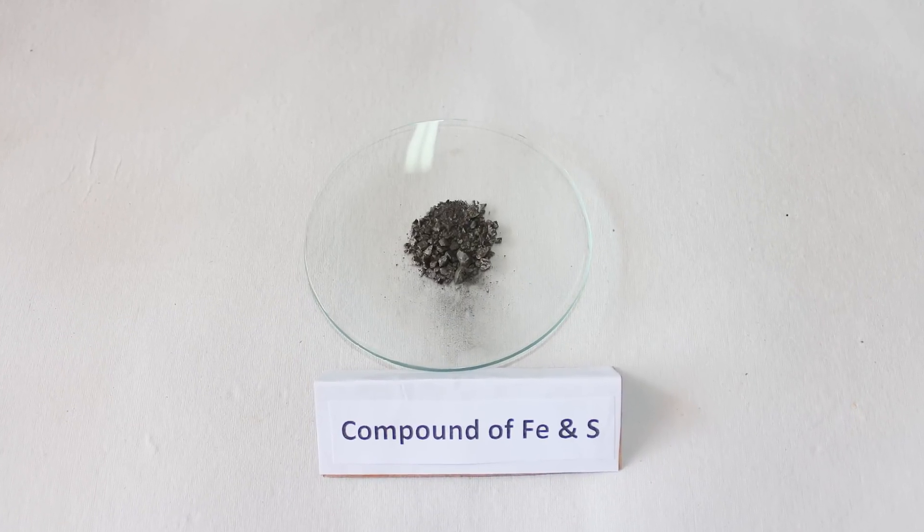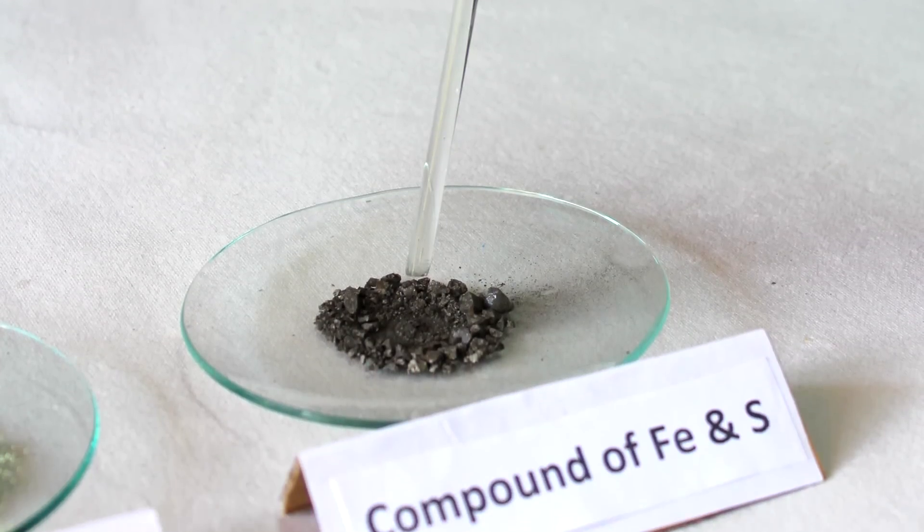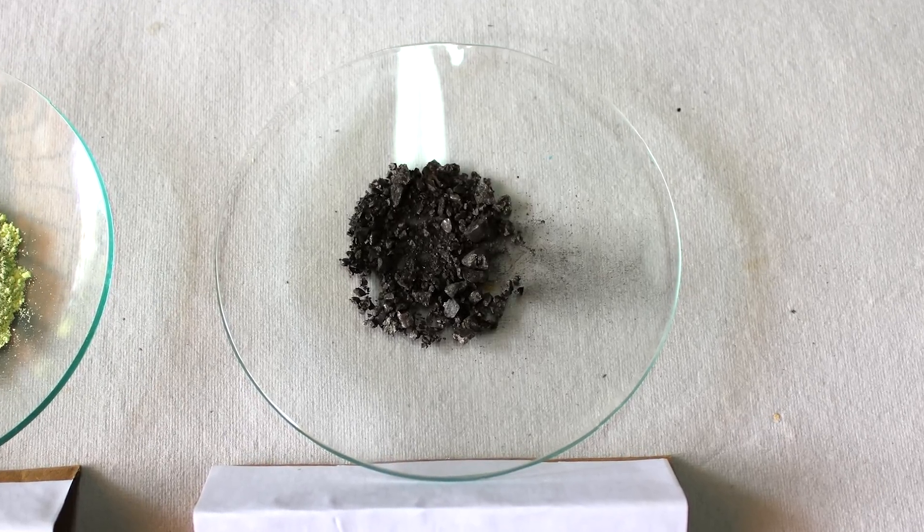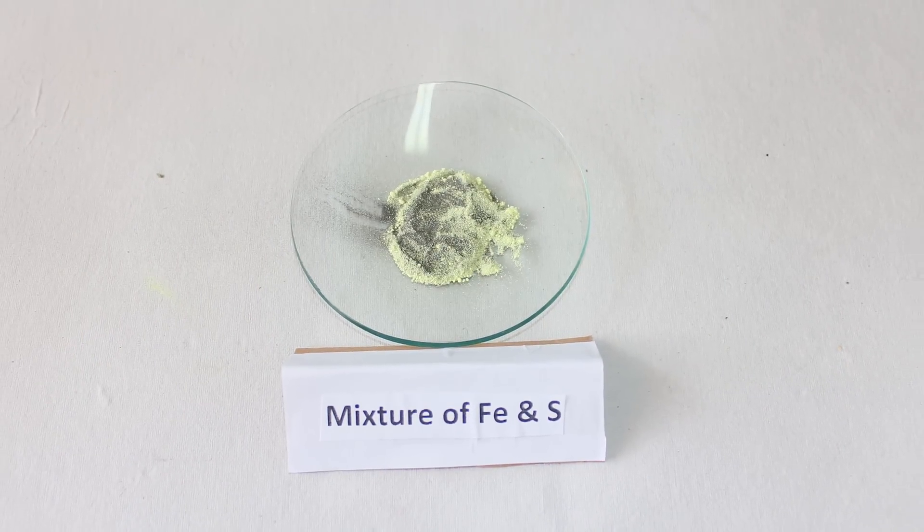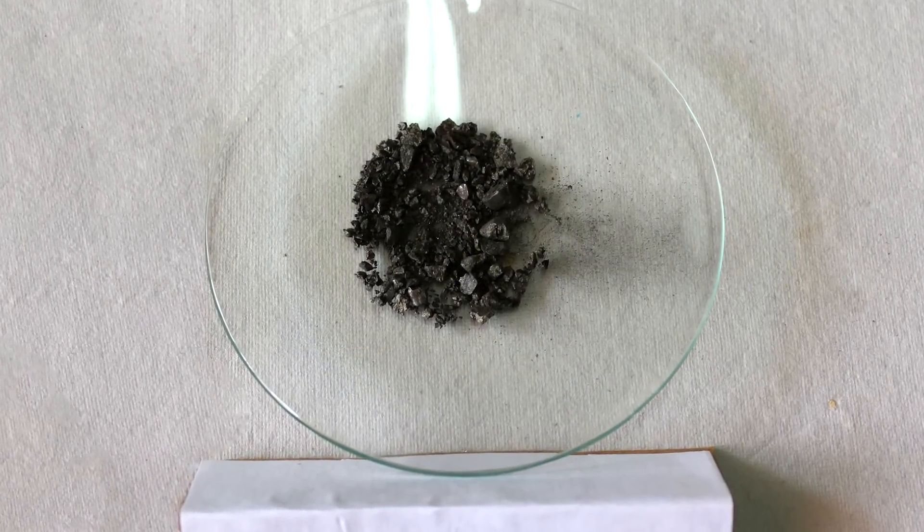Now, take ferrous sulphide in another watch glass and mix it using another glass rod. Here, we cannot see iron filings or sulphur. Thus, we infer that the mixture is heterogeneous and the compound is homogenous in nature.